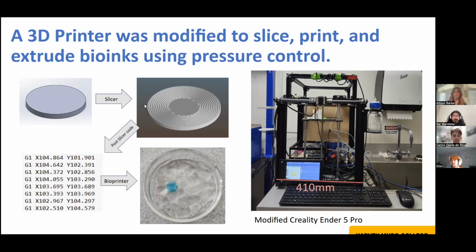The main thing that the script does is use the movements presented in the G-code file to predict the pneumatic pressure required to achieve a desired bioink flow rate at any given moment in time. This pressure is then added as a custom auxiliary command to the G-code file. Lastly, the G-code file is run on the printer, which then requests a specific pressure from the pressure pump.